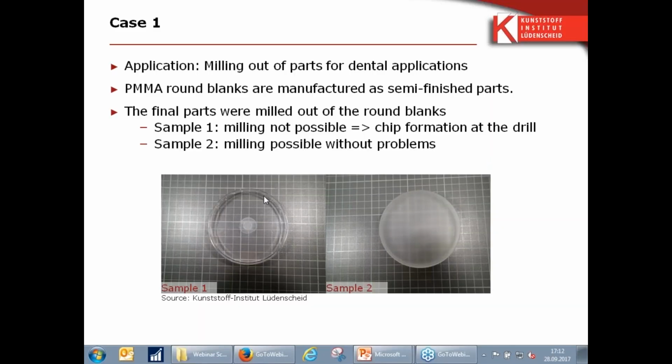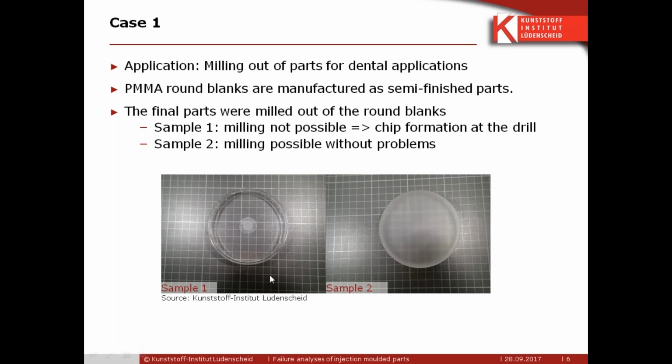Okay, thank you. I also welcome you for the webinar Failure Analysis of Injection Molded Parts. I will show you 3 different examples in the next 30 minutes, about 30 minutes I think I used the last times, and these examples will show you the possibilities of different methods to analyze plastic parts. It will show you that you often need more than one method to find the root cause completely.